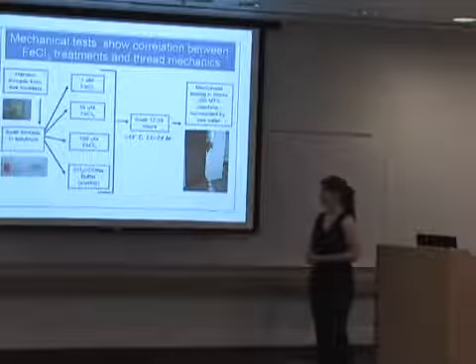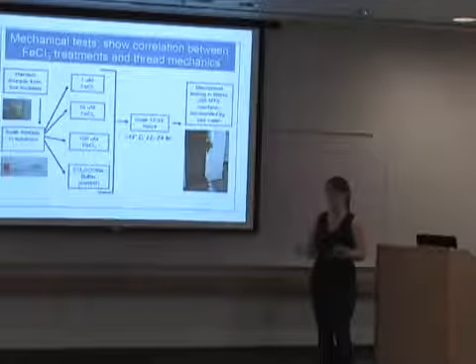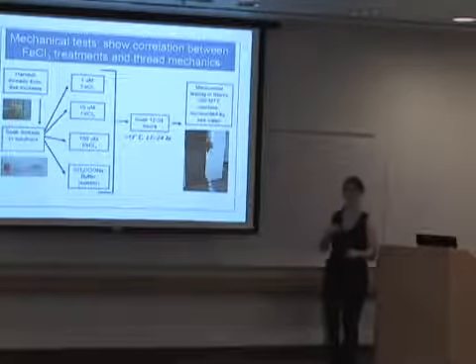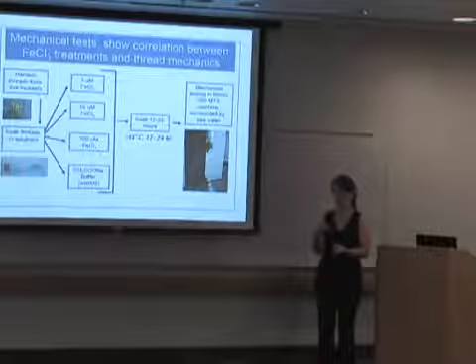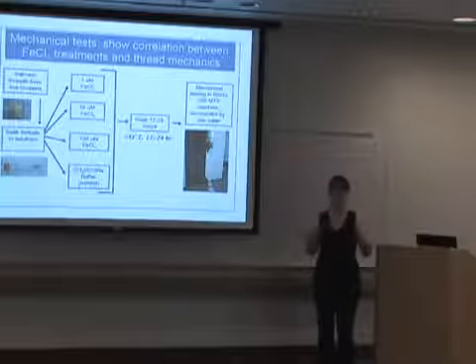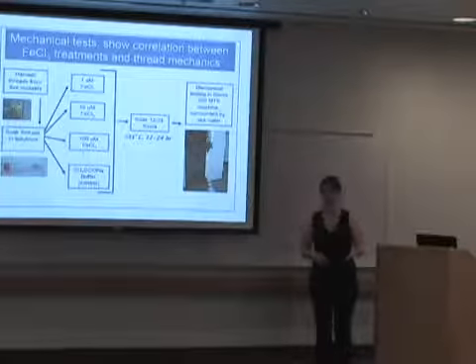I soaked the threads for around 12 to 24 hours, and then I mechanically tested them using a tensile testing machine, which, pictured right here, is basically just two clamps that grab either side of the thread sample and stretch it at pre-programmed speeds and with various parameters that I enter in.